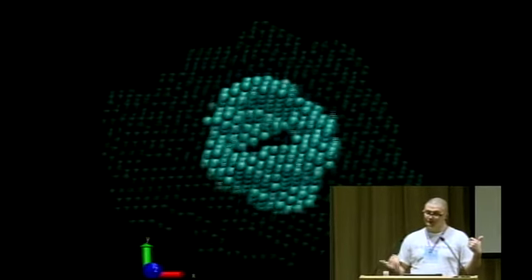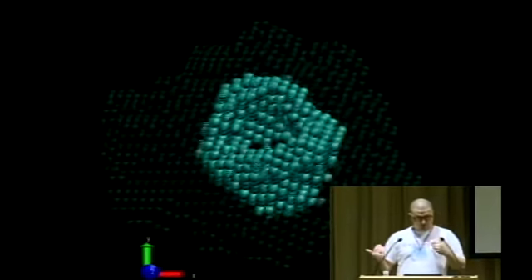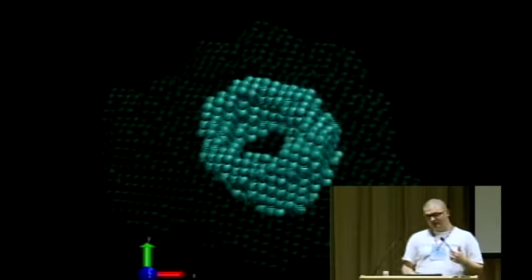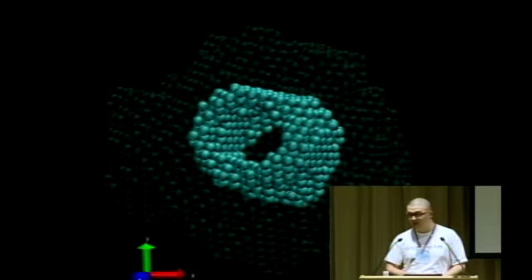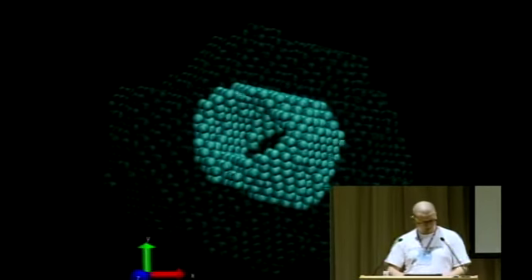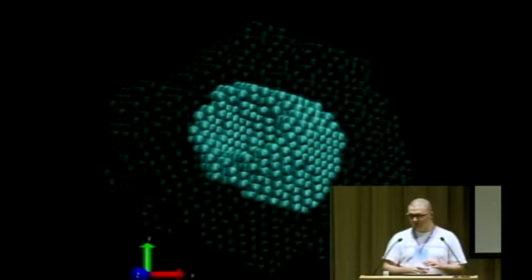So the discrepancy between the given experimental data from a hollow cylinder and the theoretical scattering from the current model is minimized, and eventually you actually do get a hollow cylinder. Amazing, isn't it?